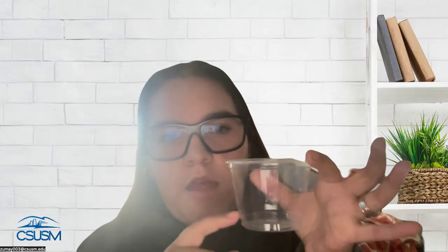Next, you're going to want to set up your contamination station. This will be a sealable bag, such as this one, with 50% of it filled up with bleach. You'll also take a cup such as this one, and fill it up a quarter with isopropyl alcohol that is either 70% or higher, such as this one.